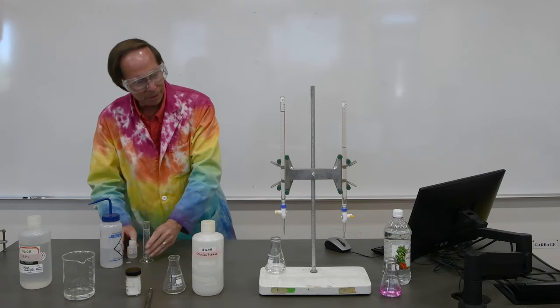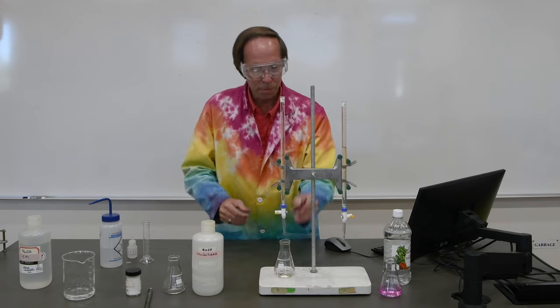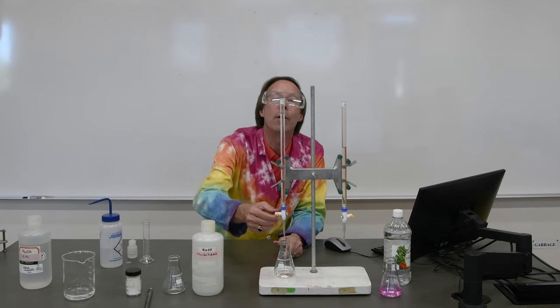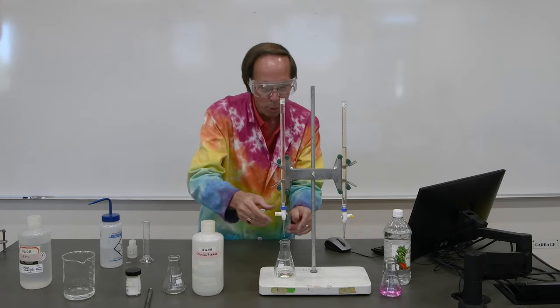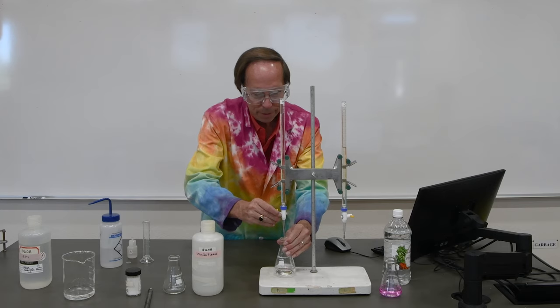All right, so we'll stop this time. Maybe we'll go down to about 11.5 milliliters or so. We'll stop about a milliliter before we saw the endpoint last time, and then we'll slowly creep up on that one drop at a time. So we're back at the zero mark again. I've refilled it back to 0.0 milliliters.